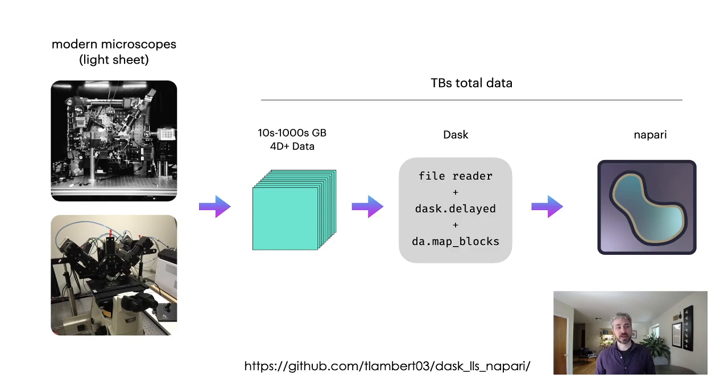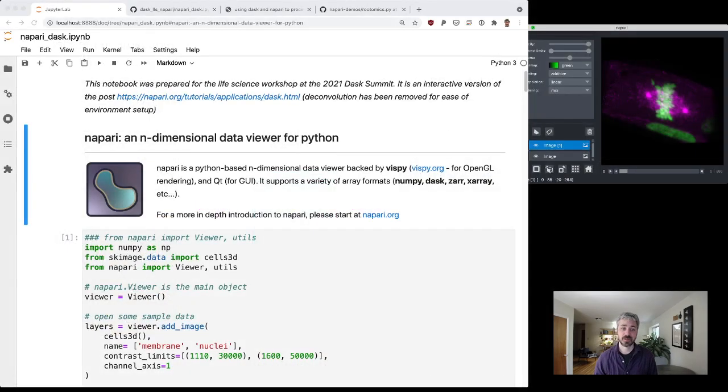So I'll point out that what I'm going to show you, this notebook, is at this repository at GitHub, where you can play with it, along with a small amount of sample data and a link to the full data set if you're so inclined.